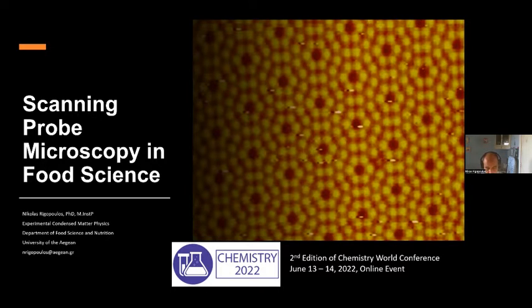Food, from the perspective of a physicist, can be considered as soft matter, with building blocks and processes occurring at the nanoscale or sub-microscale. Therefore, the idea of combining scanning probe microscopy with food science led to today's talk. It is interesting that although scanning probe microscopy was invented in 1986 by Binnig and Rohrer, up to date there are very few applications in food science.